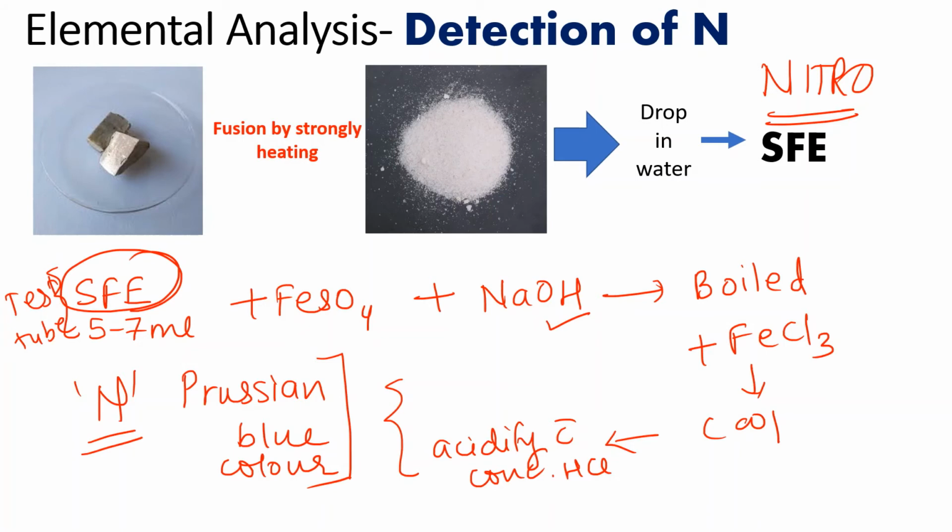And many times, based on the quality of the sodium fusion extract, whether the sodium decomposition is complete or incomplete, or whether the amount of sodium taken is insufficient or in lesser quantity than required, blue to green colors are obtained in the test tube.